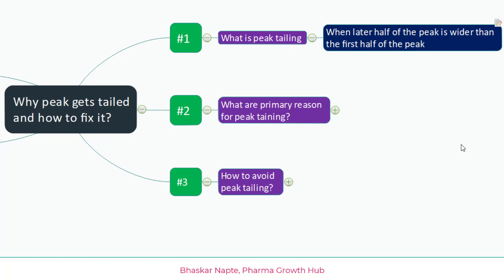When the latter half of the peak is wider than the first half of the peak, you can say that you have peak tailing. In case you divide the peak into two halves from its apex, if the width of the left half and the right half are equal, then you have an accurate Gaussian peak. But if one half is wider than the other half, you have peak tailing.